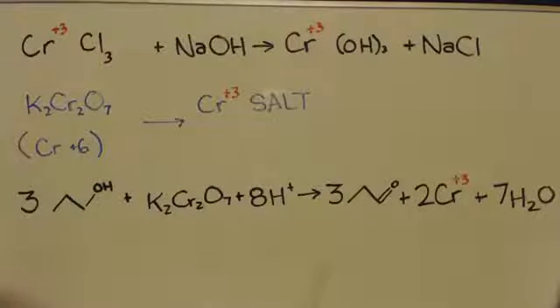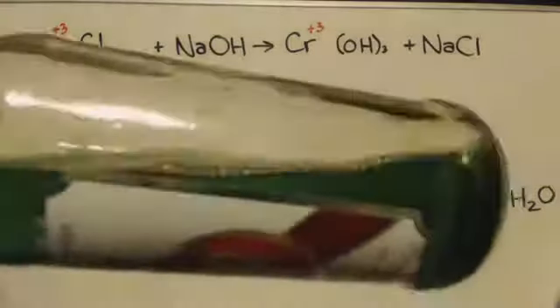And then usually when they get done, they might have some of this dichromate still in this side of the solution. They want to reduce it down because it's less harmful then. You know, +6 oxidation, nobody likes that. So they might throw some sulfite in there. But again, it would be sodium. So you still only have potassium and chromium in there, okay? Now I want you to look at this.